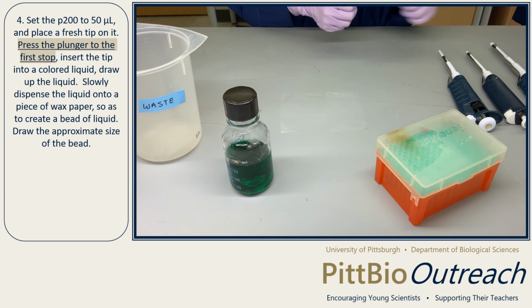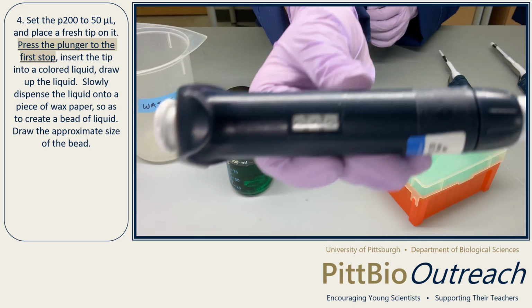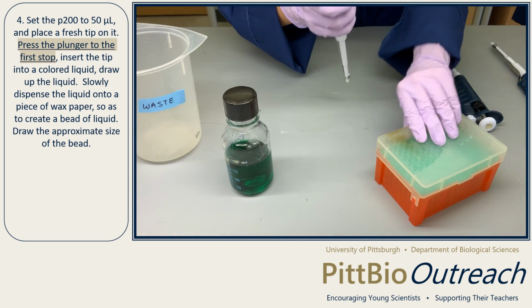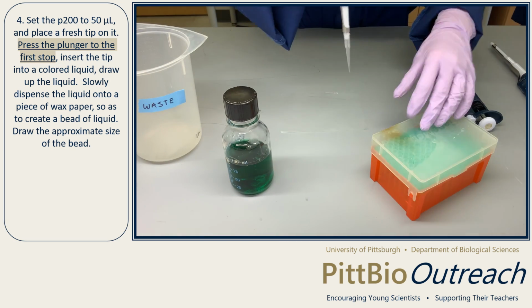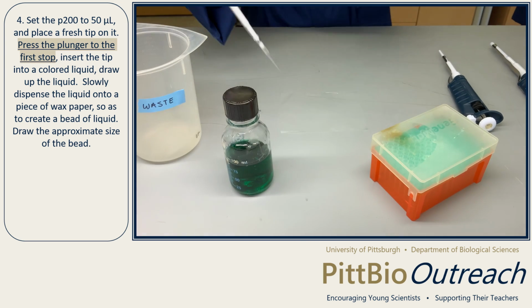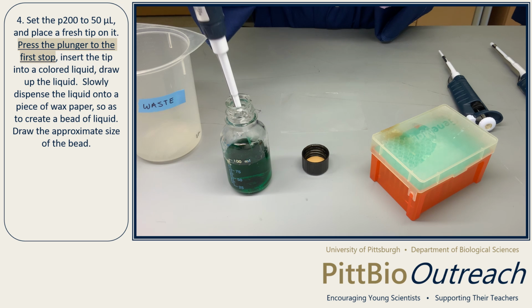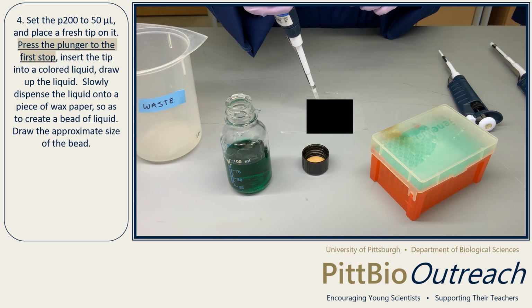Step 4. Set the P200 to 50 microliters and place a fresh tip on it. Press the plunger to the first stop. Insert the tip into a colored liquid. Draw up the liquid. Slowly dispense the liquid onto a piece of wax paper so as to create a bead of liquid. Draw the approximate size of the bead below.